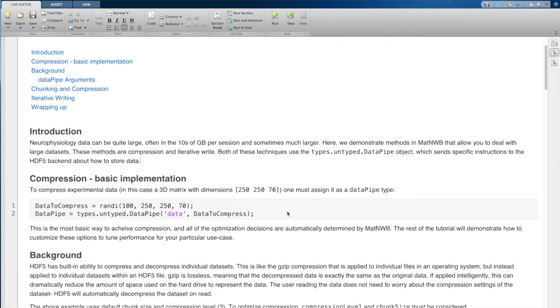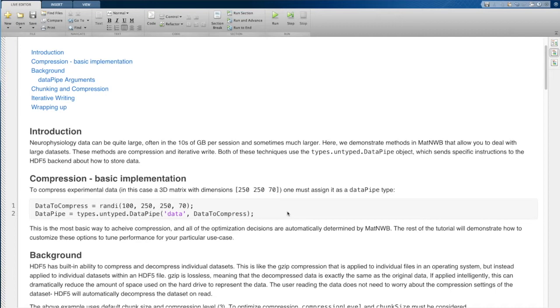Often in neurophysiology we have data sets that are quite large. If you have extracellular electrophysiology data, for instance, that is at very high sampling rate, high channel count, long sessions, you could have tens or hundreds of gigabytes or even terabytes of data per session.